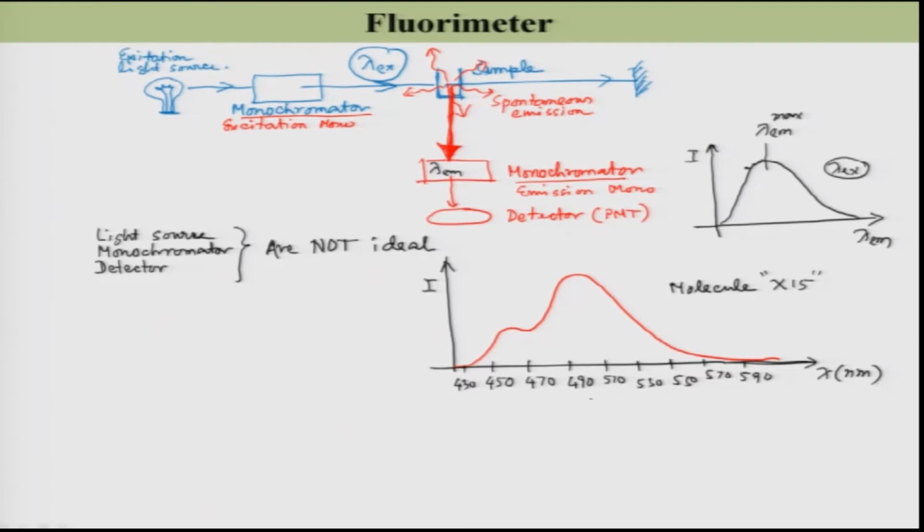So, you have taken this sample in your sample holder, and your sample is over here, and you use a particular excitation wavelength of your choice. Let us say in this case it is also known that lambda excitation is equal to 400 nanometer.